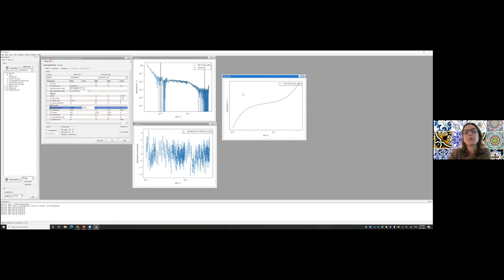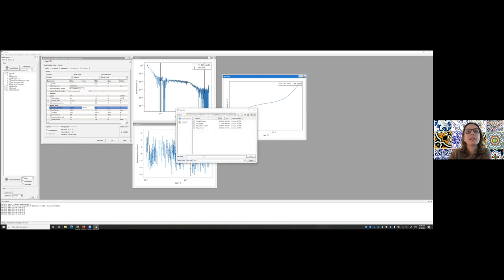So then what you do before you go on is you right click again, and there is an option that says save points as a file. So we click on that. And I'm going to save it as, let's say, SQ. I had already done this, so the file actually exists already, and I'm going to save it.